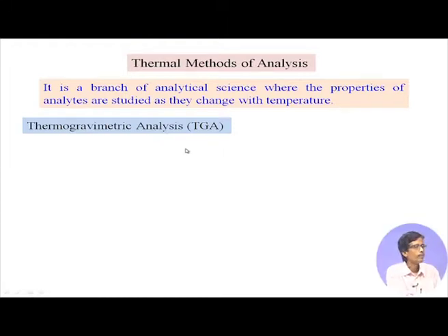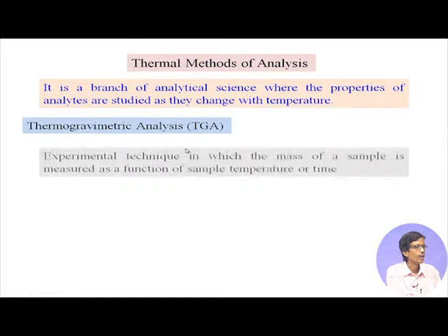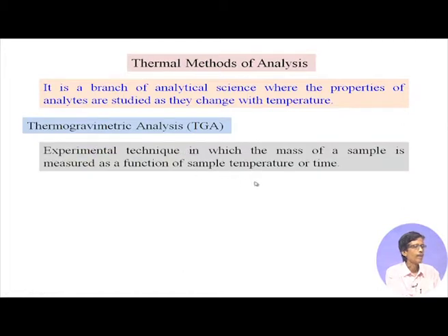The thermogravimetric analysis is a very useful analysis, a typical experimental technique, because when we talk in terms of gravimetric analysis, we must take the weight of the precipitate. So, that means a balance is coming into the picture, and we must have the corresponding analytical balance which can precisely take the change in the weight or mass with the rise in temperature.